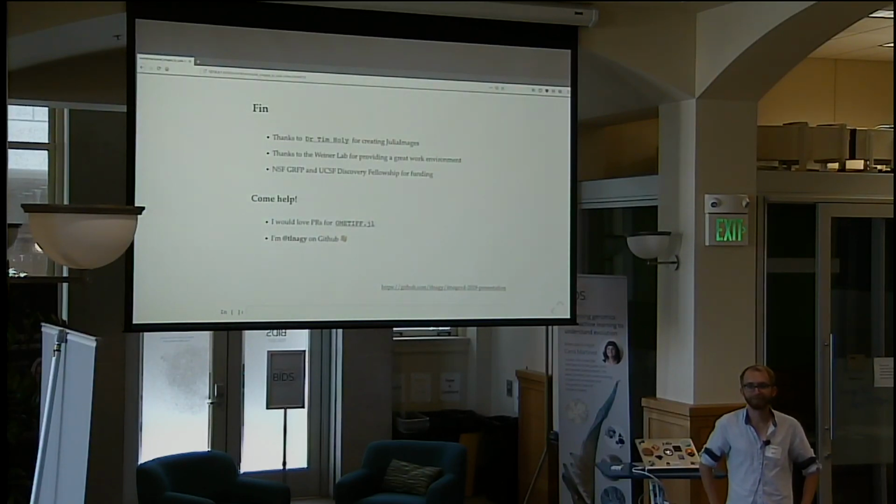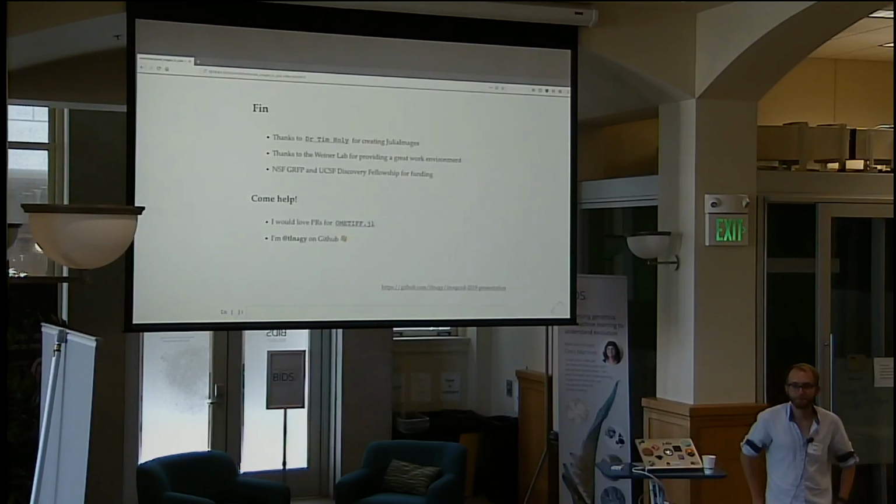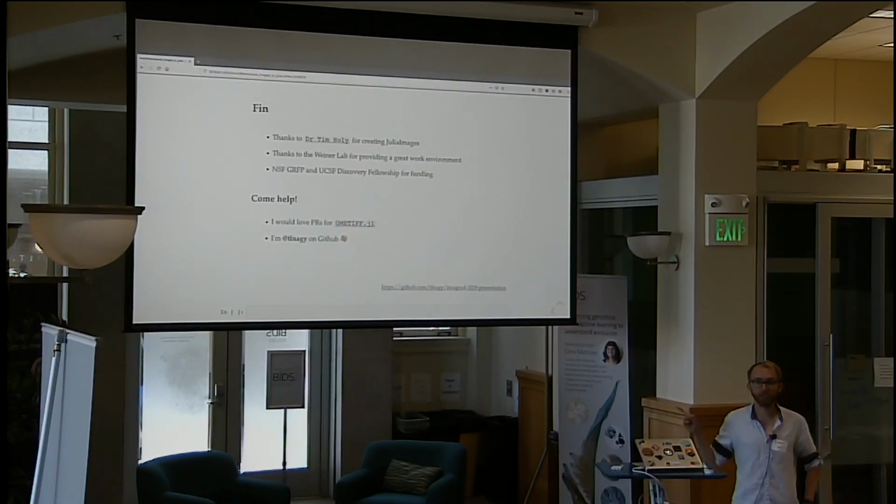That's very exciting. So the place to look at some scripts using Julia for these classical image transformations is your repository? I don't have examples of that, but I have links to the Julia Images documentation, which is very thorough.